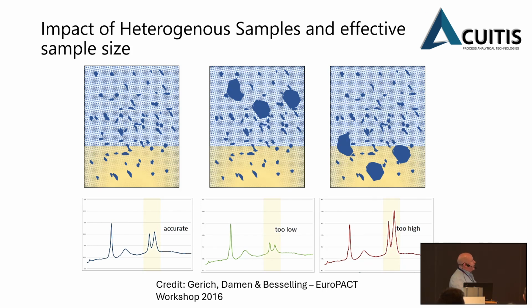So what we get is a probability field of measurement, and the shorter wavelengths penetrate further into the sample than the longer wavelengths. And this is something that's important to consider. So in reality, when you do studies on a typical blend, you're interrogating somewhere between 350 and 500 microns of depth of material. So things like spot size and that depth become important.